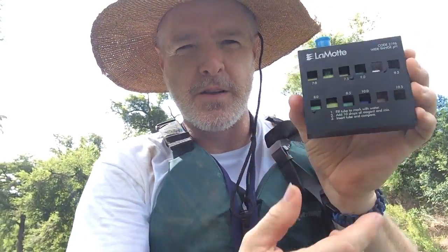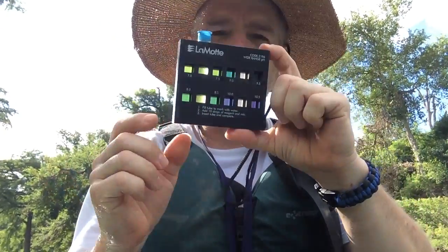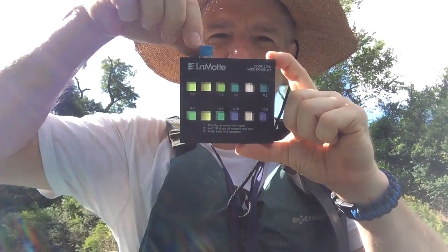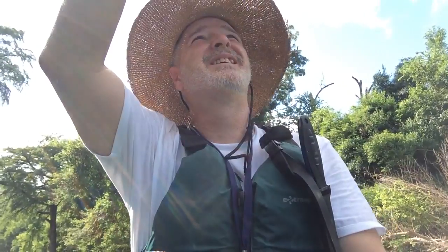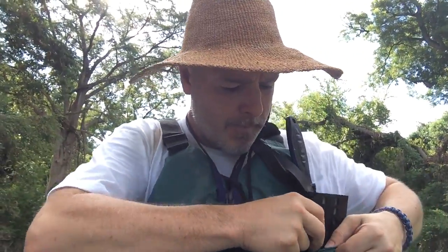Slide it into the viewfinder. There's our sample. If you look, you can compare it to the actual pH measurements that are part of this. We'll take it out, put it back in. What pH do you read? I'm going to give it a 7. So pH reading — I'll say 7.